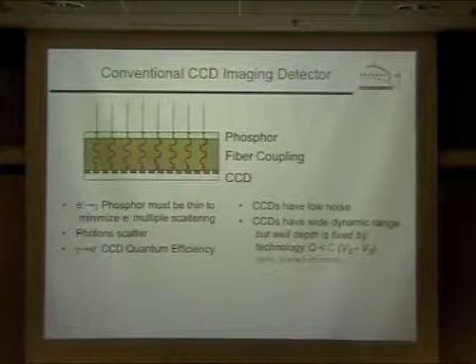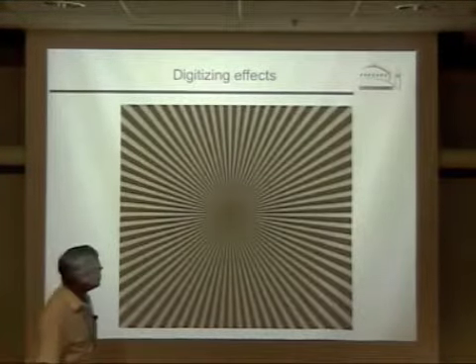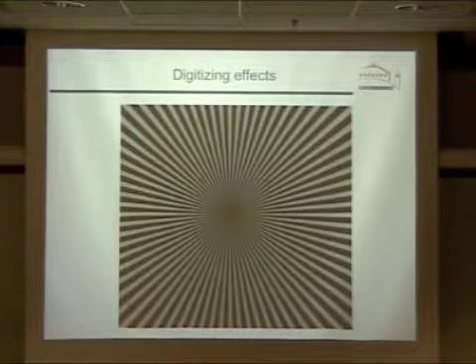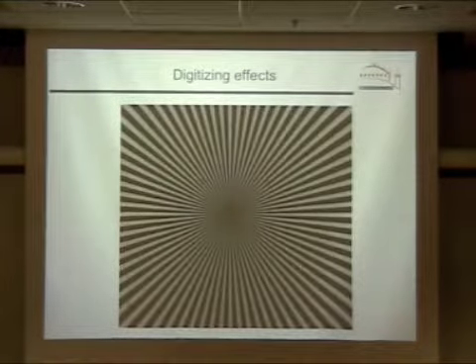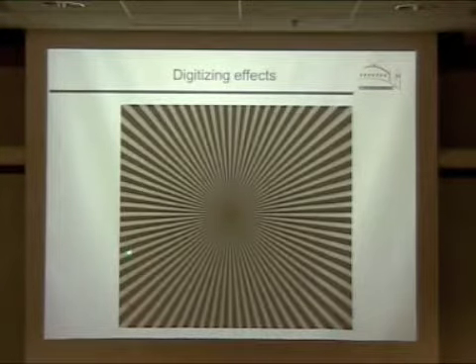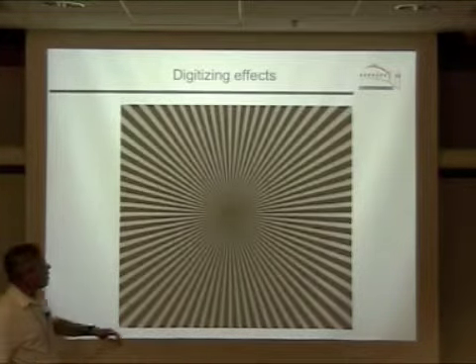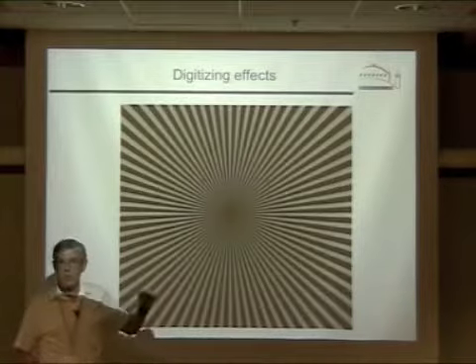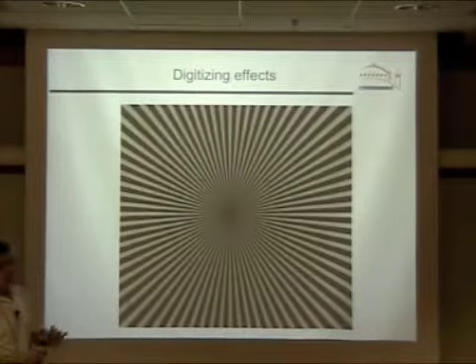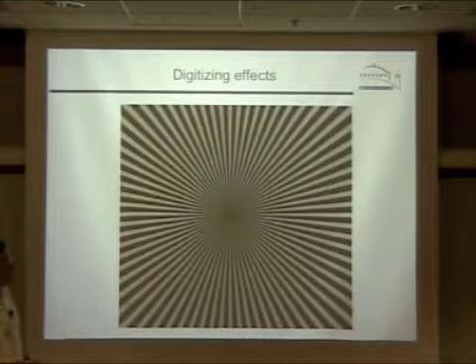Enough of structure. I was hoping this might come out a little bit differently than it does here. This is originally a very high resolution pattern of spokes where there's really 100% contrast between the dark bars and the white bars, all the way into what you see here as a little white dot in the center. This was a fairly expensive test pattern, and the original version of it had little bars that were about a micron across, right in toward the center.